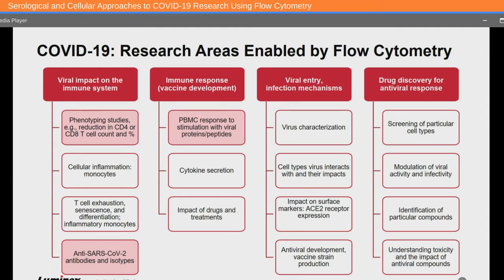Several researchers are thus interested in obtaining information on both cellular and serological aspects in their investigations. Currently, many of these studies are being performed on separate platforms, and technologies that can enable obtaining both cellular and serological information on the same platform can provide a great deal of flexibility and convenience to researchers.